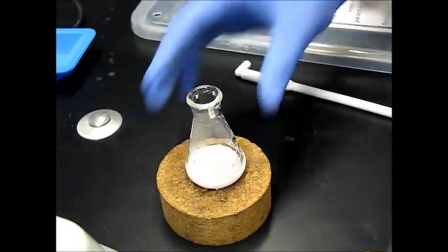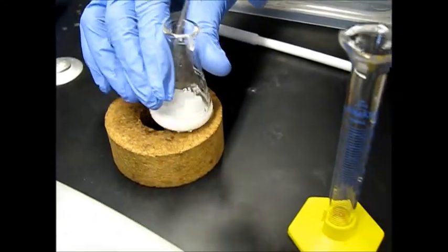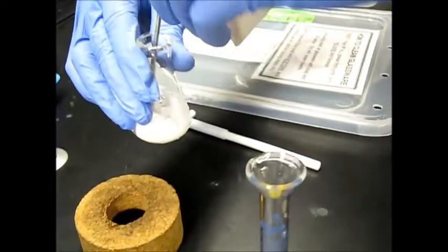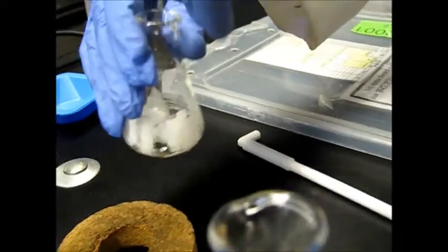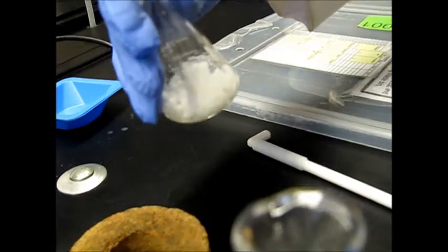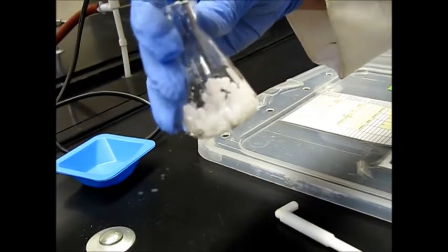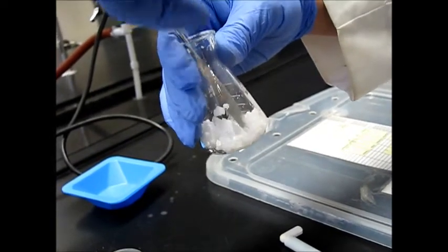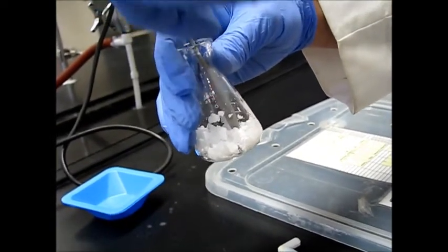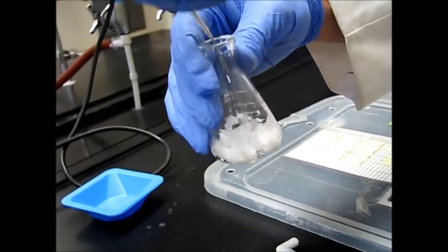Cool. And in the manual it does say to stir with the micro spatula just to help that precipitation occur and get the water everywhere. Now this next step is we're going to be eliminating any borohydride that's trapped in this solid. So we'll go ahead and do this right now.